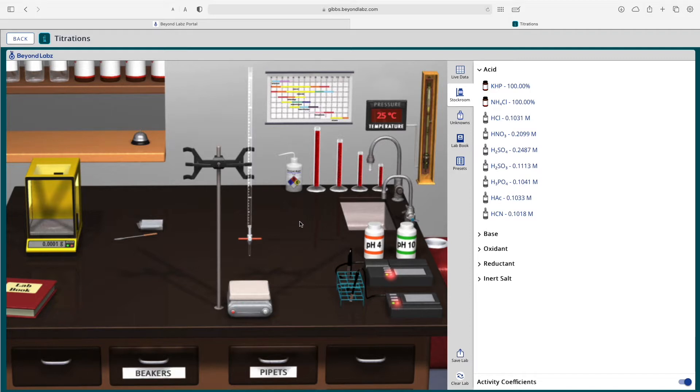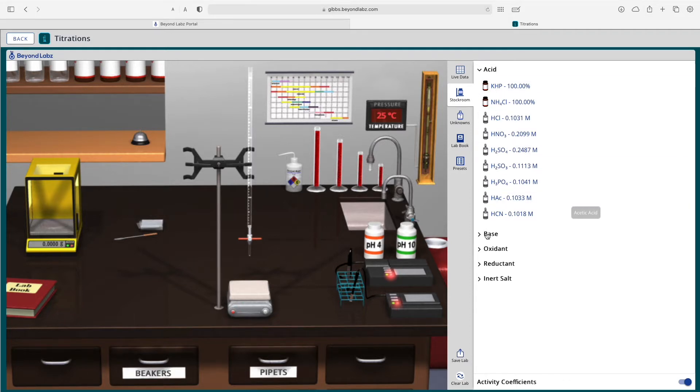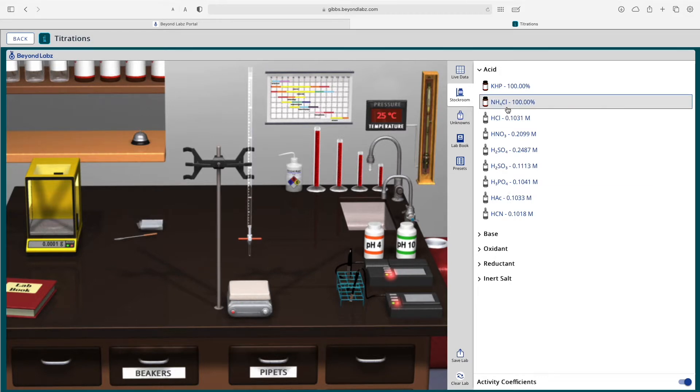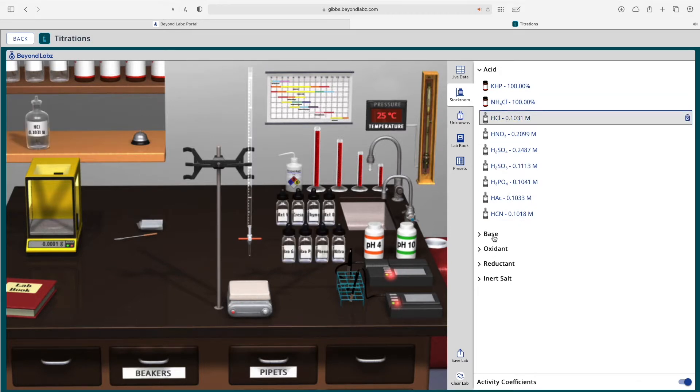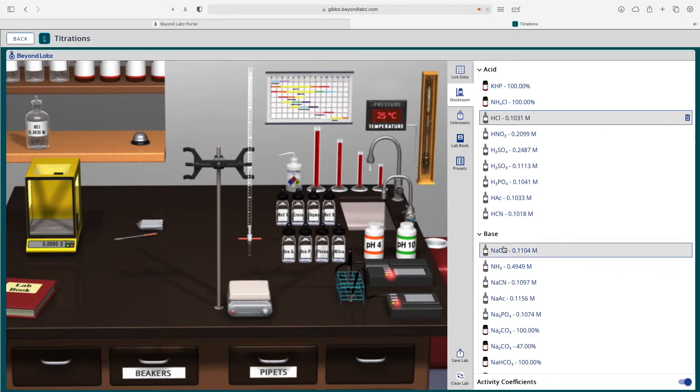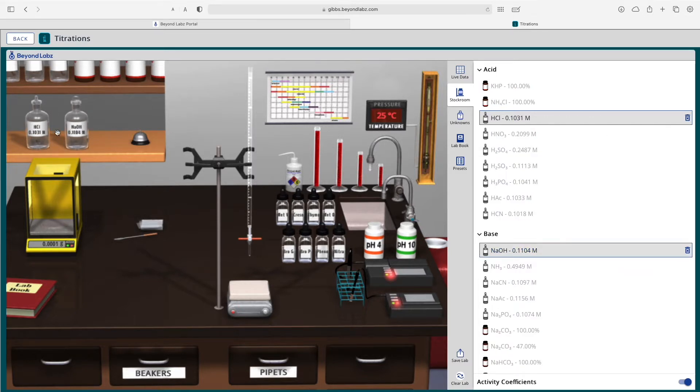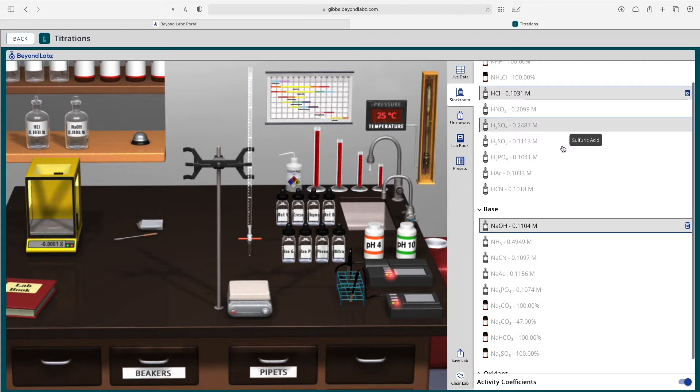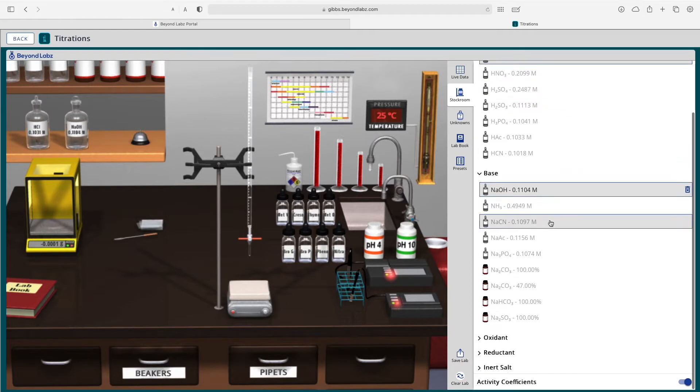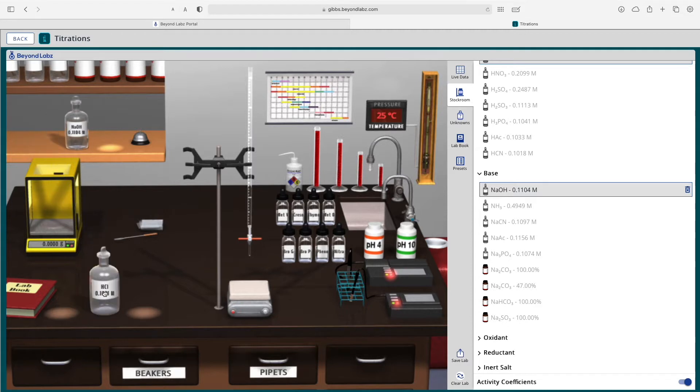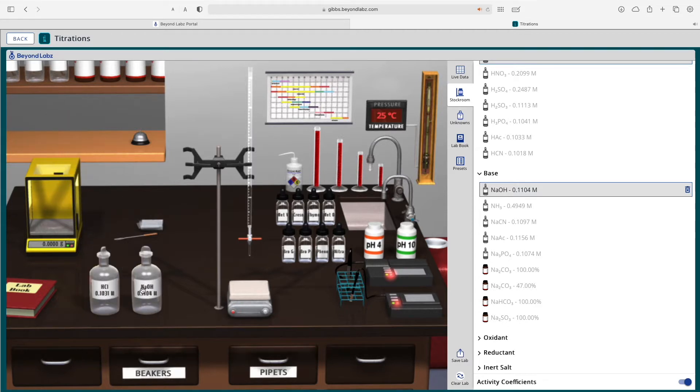To get started in the titrations laboratory, you will probably want to get an acid and base or perhaps an oxidant and reductant or even an inert salt. I'm going to select hydrochloric acid and sodium hydroxide, and those solutions or compounds that you pick will be placed on the stock room counter. You can have two at a time in the titrations laboratory and you can drag them down to the lab bench.